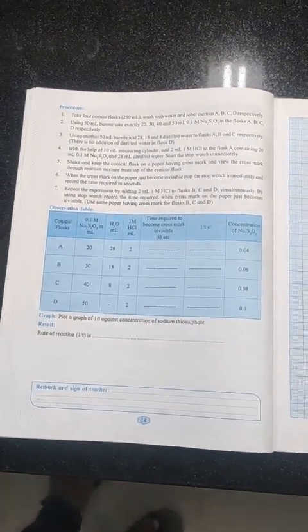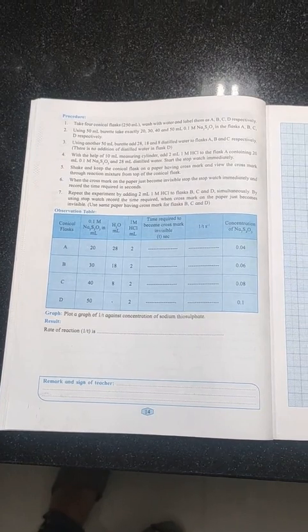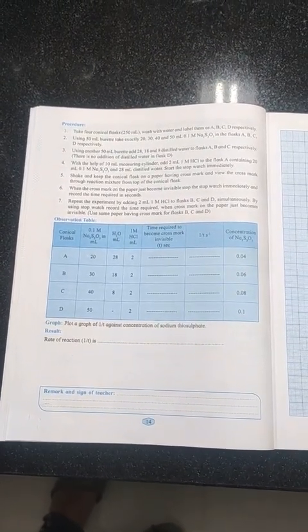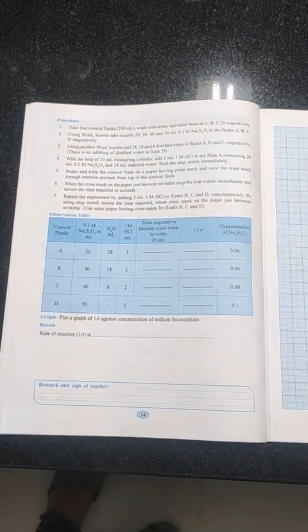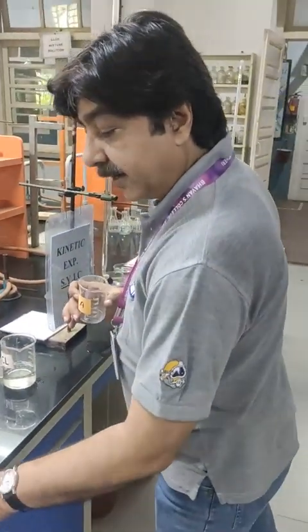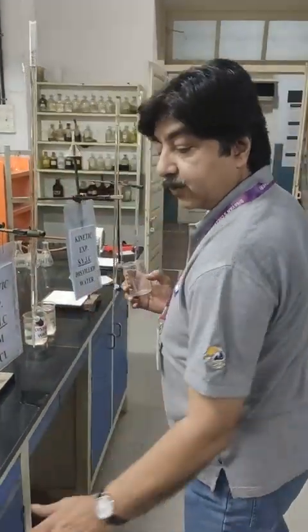In reading A, we are going to take 20 ml of sodium thiosulfate solution, 28 ml of water and 2 ml of HCl. So first I start with 20 ml of sodium thiosulfate, Na2S2O3.